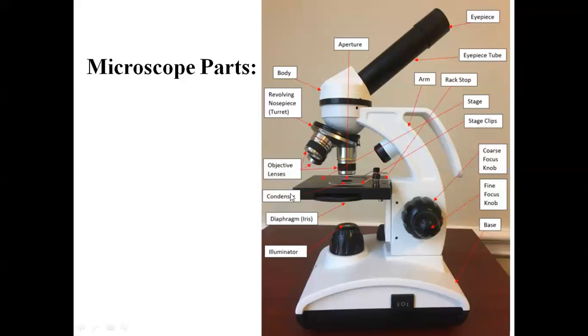All the light coming from the diaphragm will be condensed and will come out of this hole and finally reach the sample. This hole we can call the aperture, because the aperture is the place where light comes out and enters the sample, right?